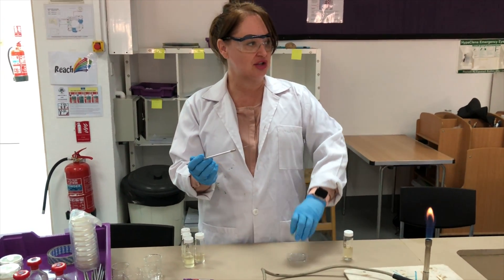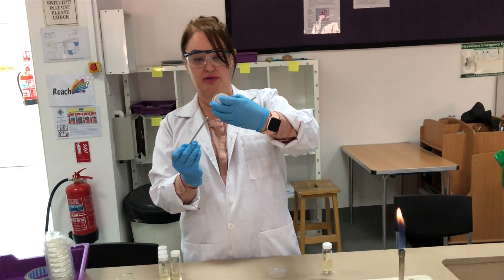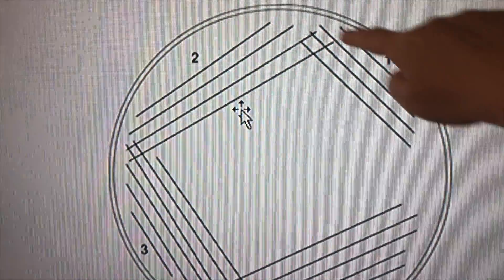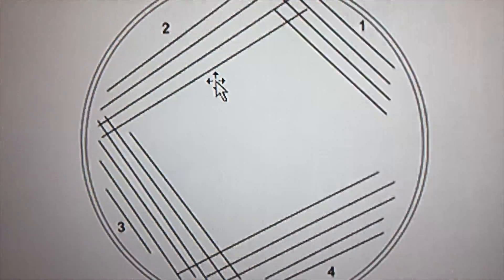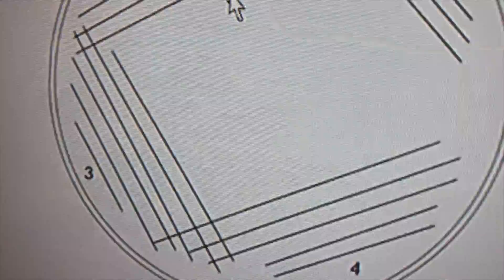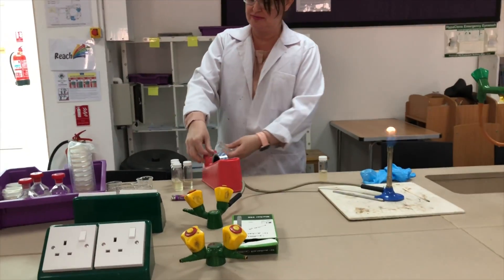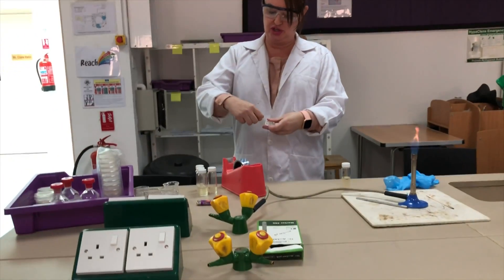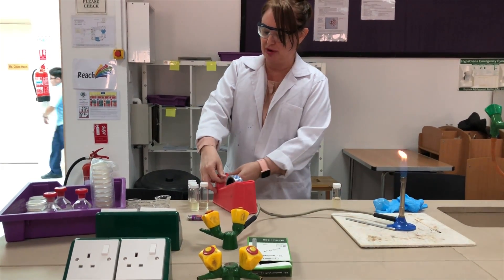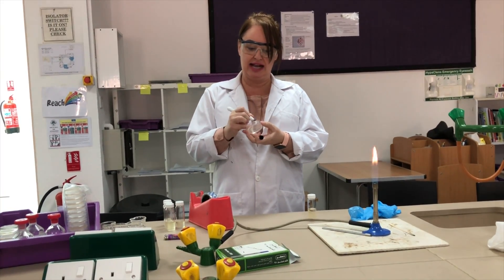Then take your agar plate, lift the lid but not completely, and streak it across. You're going to do four streaks — the first came from the McCartney bottle, streak two comes from streak one, streak three comes from streak two, and so on. You are then ready to place the lid on. Seal it with three pieces of sellotape so the lid won't fall off, bacteria can't get in, and bacteria can't escape. Then place your initials and date on the underside.